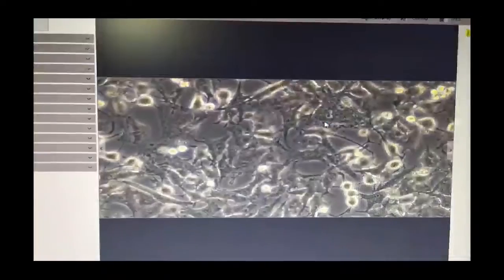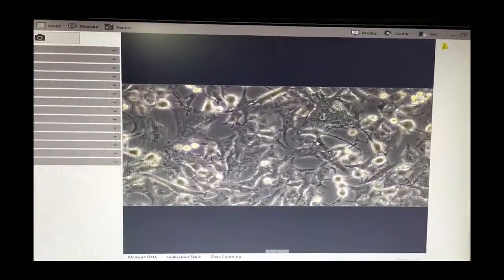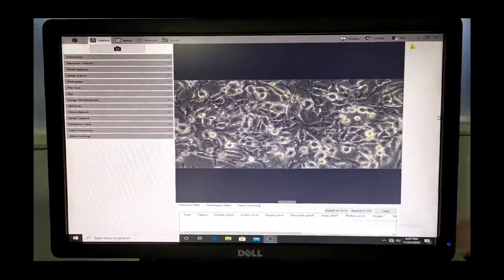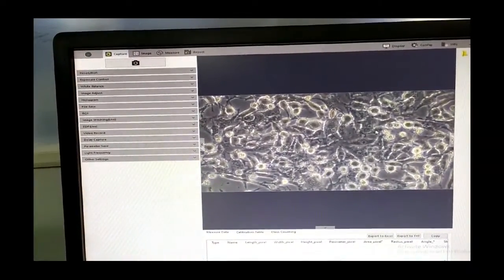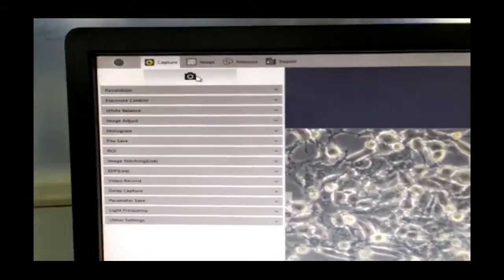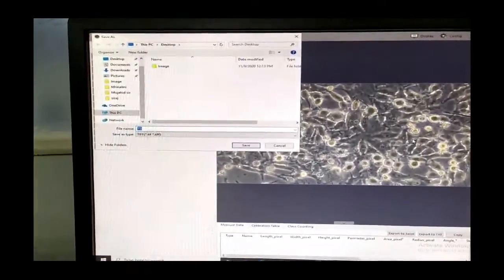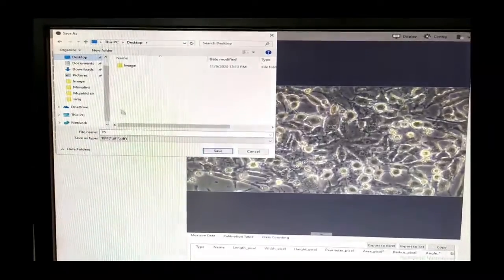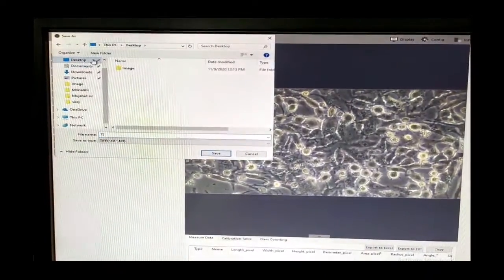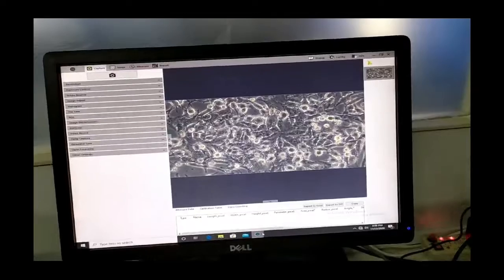Now the magnification power is 20x, so we will be able to see a bigger picture of the cells. These spindle shapes in the background are all cells which have adhered to the surface of the T-flask. We can save the images of this magnification for future reference. This is the image being captured at 20x power. There is a camera icon in the software — click on it to capture the image. You can give the file name and decide the folder path to save it, for example on the desktop.